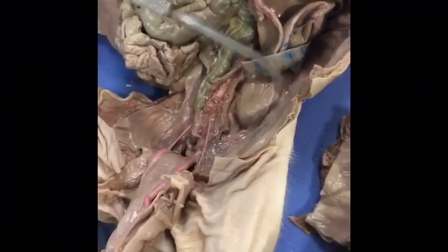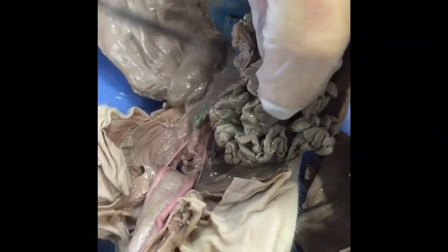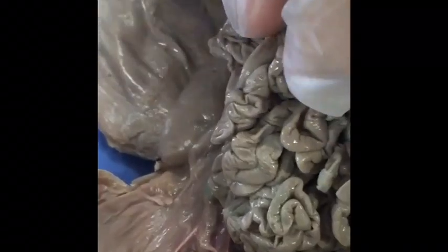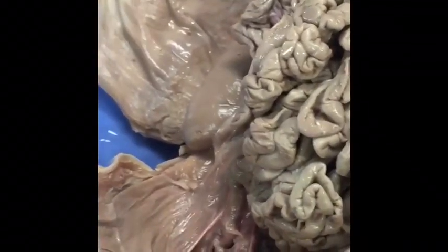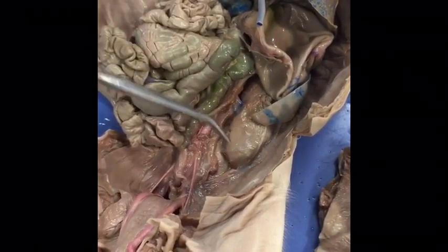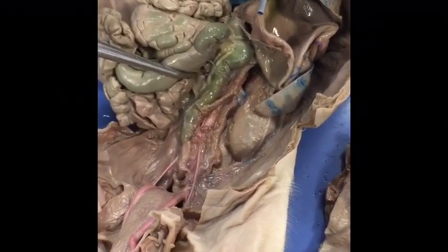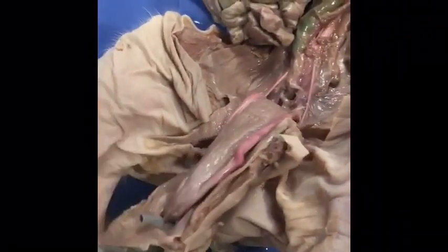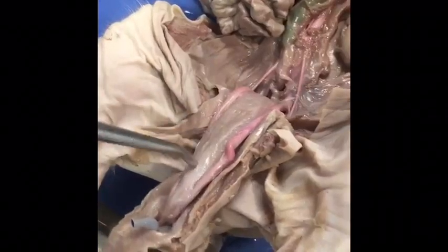This is one of the kidneys. There's another one on the other side right here. The kidneys take in the blood through an artery, filter it as if they were a sponge, and then release it back out into the ureter, which then carries the urine from the kidneys to the bladder. Point where the bladder is. The bladder then holds the urine until the pig pees, I guess.